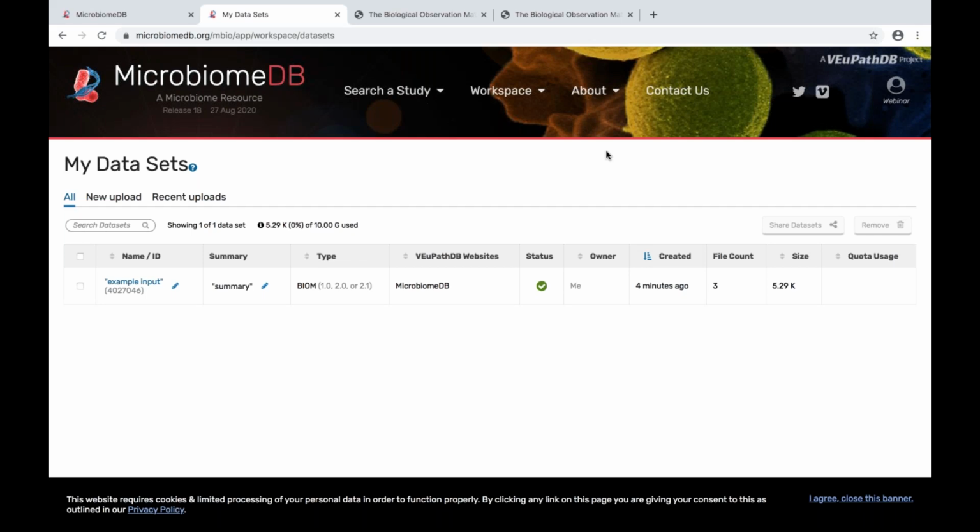So that's really great. I'm not sure what the taxonomic tree would look like if you provided not bacteria but some other things, because we try to show it like kingdom, phylum, species. But there are attempts to make it work, whatever you provided, and I expect it to be quite flexible.